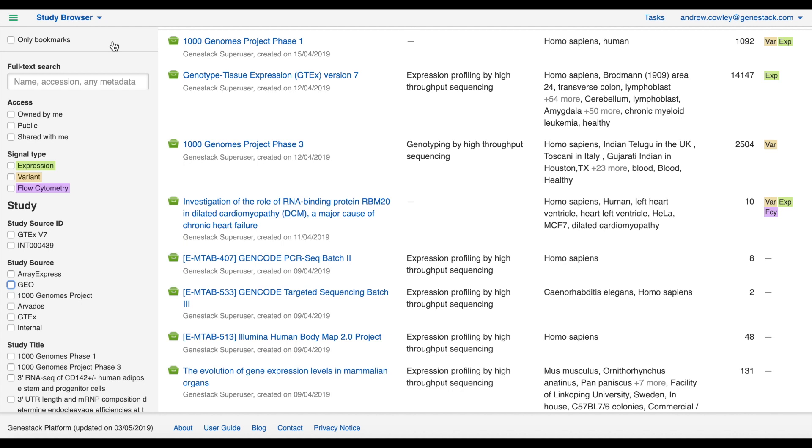The panel on the left hand side gives you the option to search and filter the results. The main panel displays the results of your search and filter options, if you have any, or otherwise displays all studies that your user account has visibility of, ordered by date with the newest at the top.